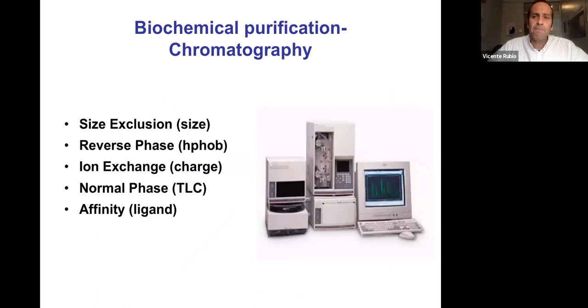So different systems have been developed to overcome these limitations and to purify proteins right away from cell extracts from plants.